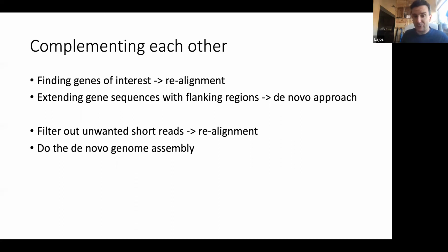So the best way, if you do this second approach, is that you try to find out what is the contaminant, what is the unwanted bacterial species or unwanted genome there, and try to find a very good reference genome for that one. Even if it's not known, if you can find a metagenomics assembly somewhere, try to find something which is matching well, and then use that reference genome to align your raw reads. And if they are aligning, exclude them.